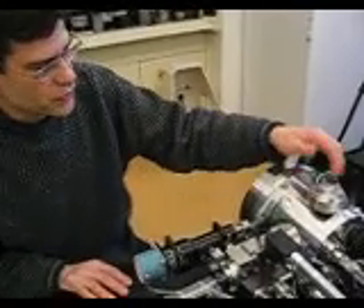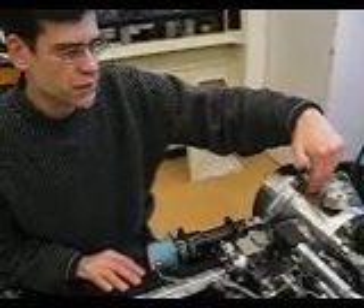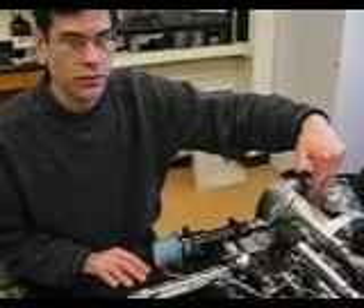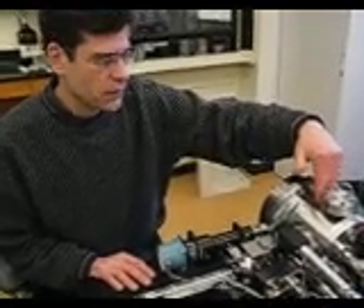In the ion source chamber, positioned right at this location, but inside this stainless steel manifold, is the MALDI plate we've already positioned in there.